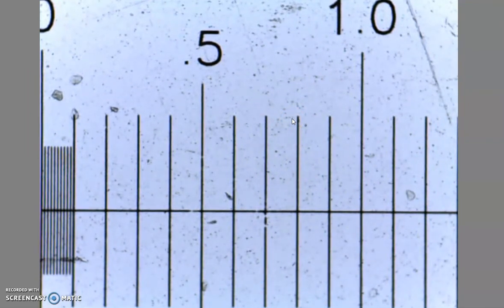Again, you're going to be measuring a circle, so you're going to have to do this as close to the center as possible, and again, it will be bigger than this. But the field of view I'm looking at on this specific microscope is 1.3 millimeters. So if I had one cell that took up the whole thing, it would be 1.3 millimeters in diameter. If I had one that took up half, it would be about 0.7-ish millimeters in diameter. If it took up a quarter, it would be like 0.4-ish in diameter. So you get the point, right? We can estimate how big a cell is based upon how big our field of view is.